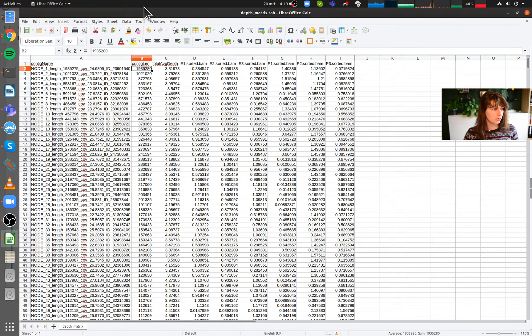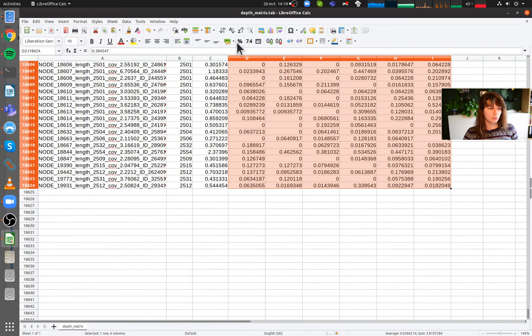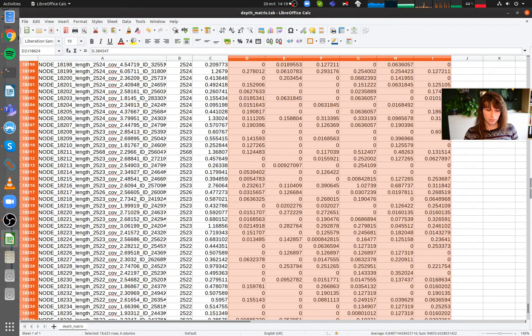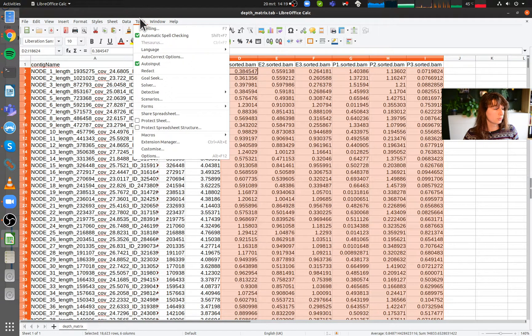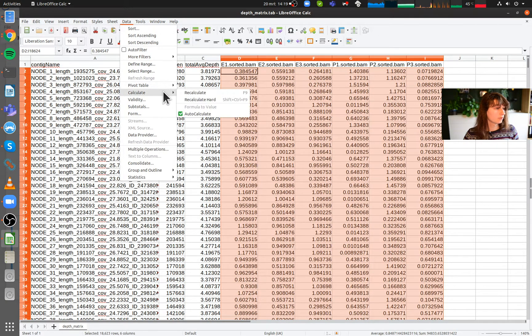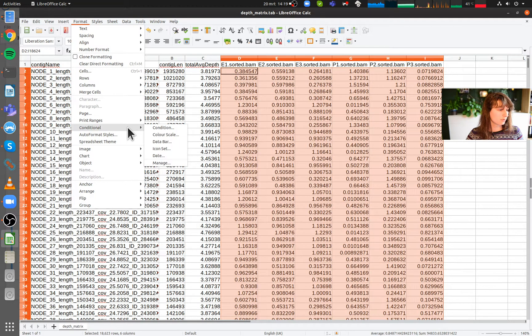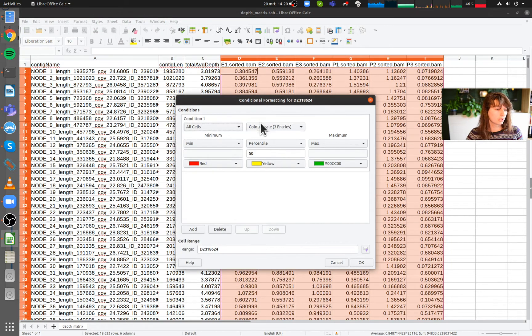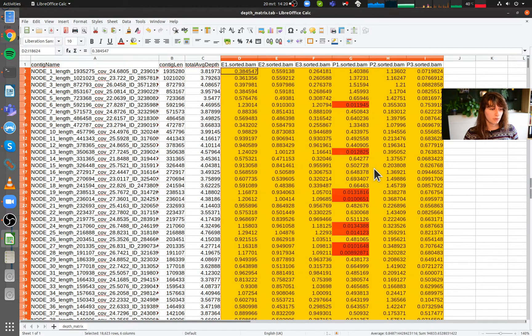What I'd like to do now is select only those columns with the depth information for the different samples. I do Control+Shift, arrow to the right, arrow to the bottom — that's everything selected. Now I'm looking for conditional formatting. This will be slightly different for each computer — for me it's under Format. Then Color Scale — that's what we want. The minimum is red, somewhere in the middle is yellow, and the maximum is green.